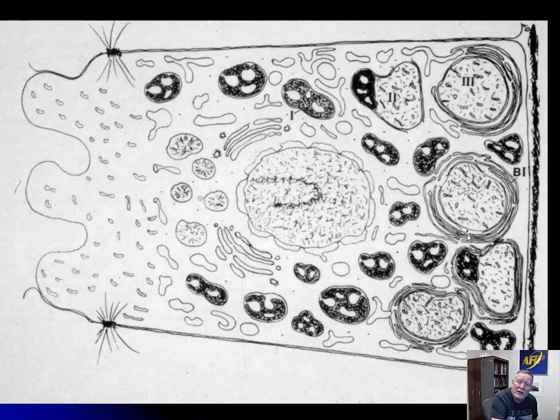One flips over, they become very sticky, and they start to wrap around the outside of each affected organelle. So all of this probably was part of the membrane of this degenerating mitochondria. And that's part of either high amplitude swelling, or you can see that in cells that have been poisoned by a number of drugs which have a detergent effect on the fat in the cell membrane, or any type of peroxidation by agents which cause damage to unsaturated fatty acids, cationic detergents.